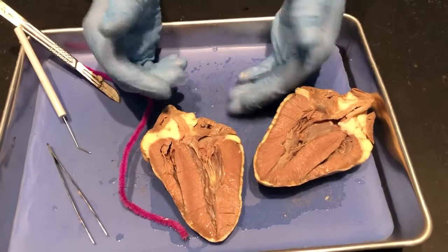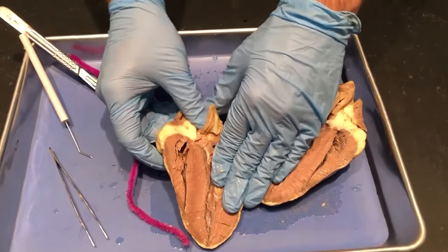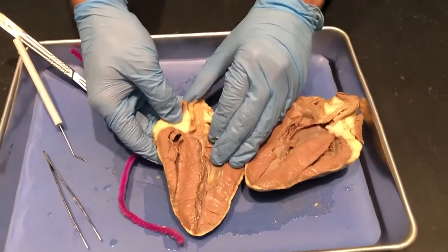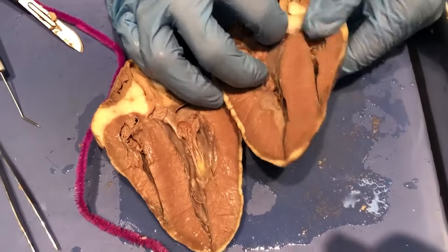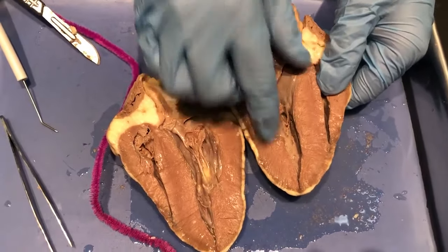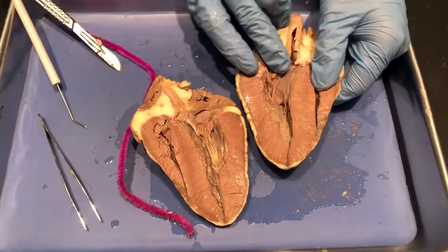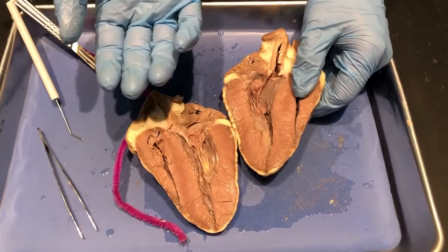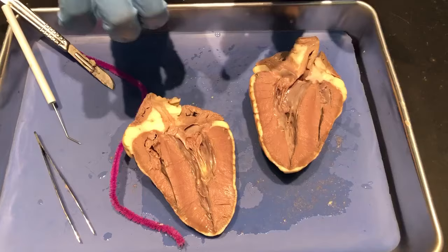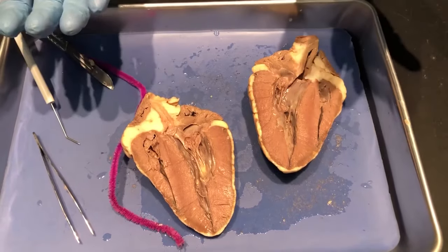From the left atrium it goes into the left ventricle, and then finally out the aorta, which is this long tube right here at the very top — you can kind of see it right there. So we have the left ventricle and the left atrium right here, and that is what allows blood to flow back into the body where we can then use the oxygen and nutrients connected to it to power up our body.